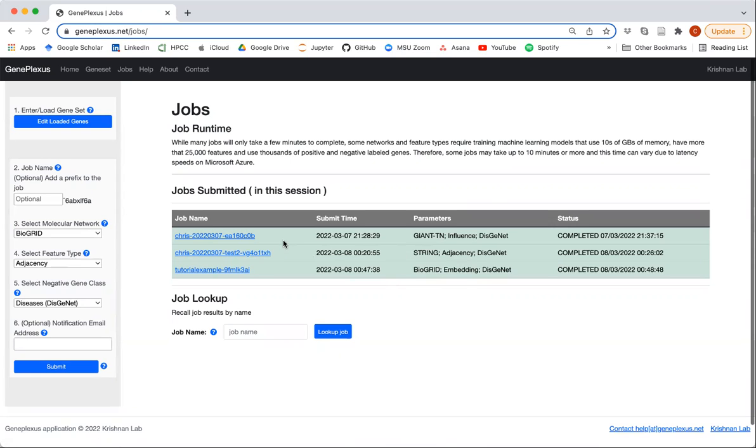We don't have any login information or user accounts set up at this time, and we want to be explicit: we're not using tracking cookies or cookies for anything like that. We're just using cookies to make the website more user friendly.